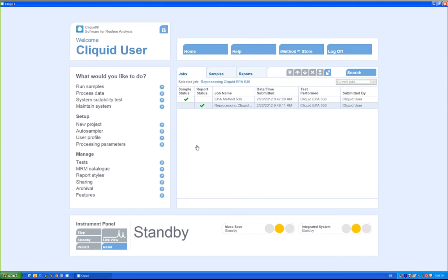I have just walked you through a fairly routine scenario for most labs. The methods have already been generated, and all the analyst has to do is select the test for analysis.